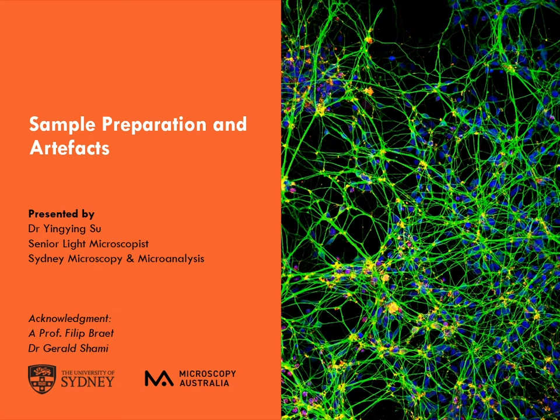Hi, I'm Dr. Yingying Su. I'm the light microscopist from Sydney Microscopy and Microanalysis. Today we are going to talk about sample preparation and artefacts in light microscopy.